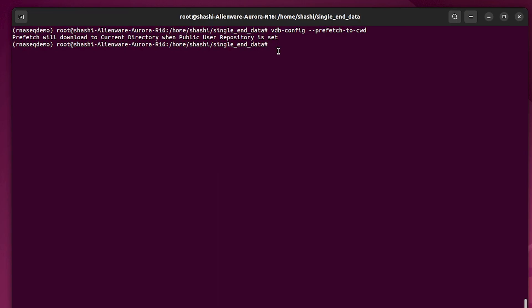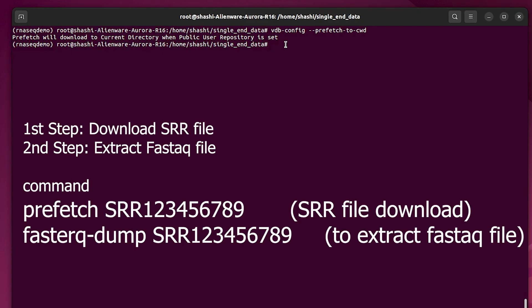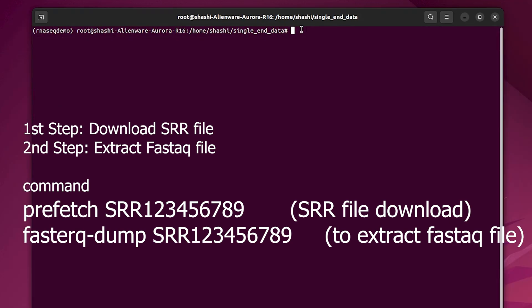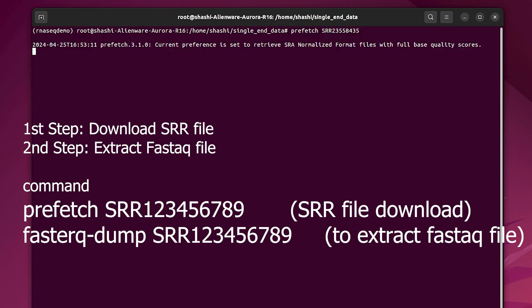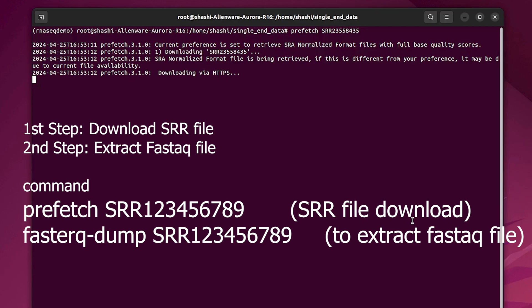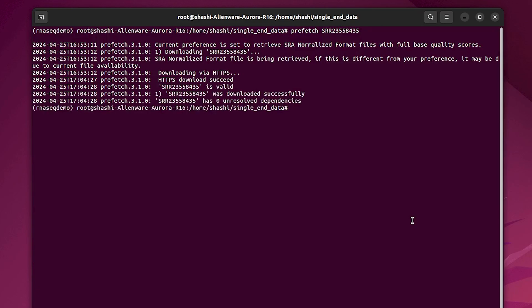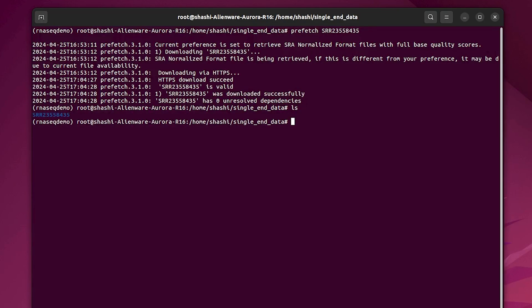Now I'm going to show you how to download the RNA-seq data file. There are two major steps: first, download the SRA file, and next, extract the FASTQ file from that SRA file. The command is: 'prefetch SRR23558435'. Press Enter and here you can see the SRR file was downloaded successfully.